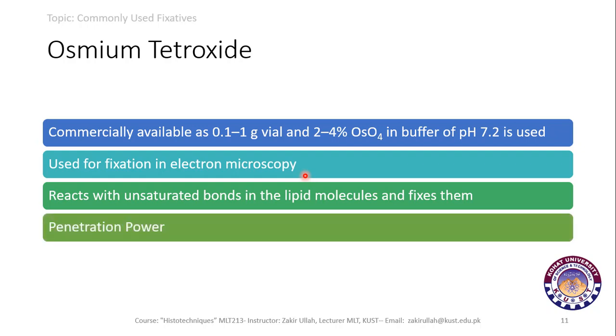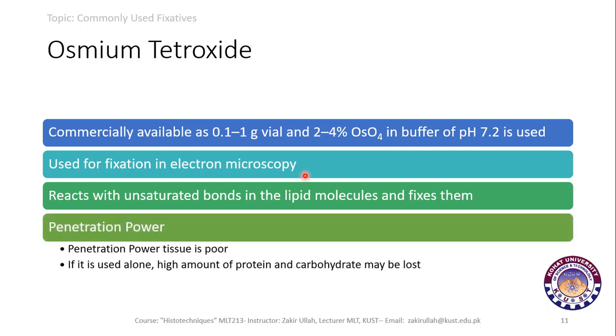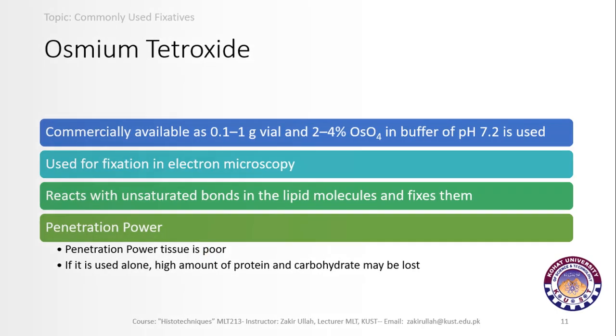The penetration power of osmium tetroxide is poor, and if osmium tetroxide is used alone, then a high amount of protein and carbohydrate may be lost from the tissues.